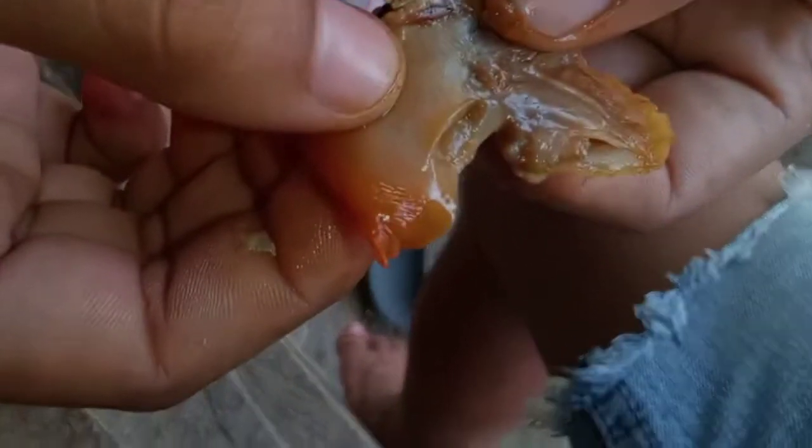Anterior and posterior muscle. At the anterior end, two pairs of flaps termed labial palps surround the mouth and direct food into the mouth. At the base of the visceral mass is the foot.